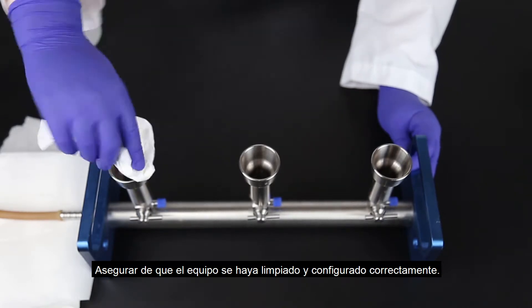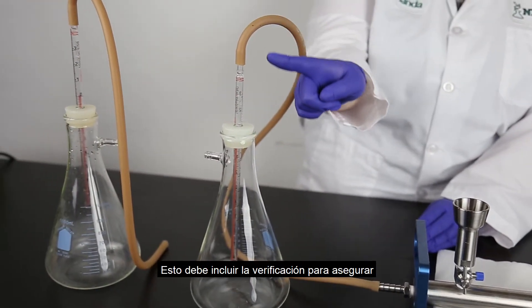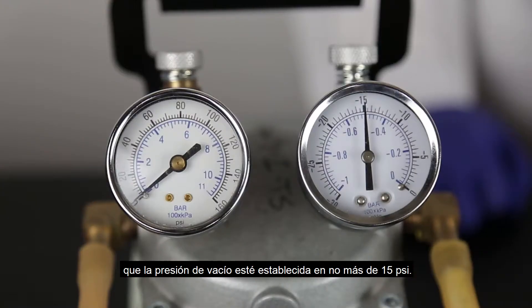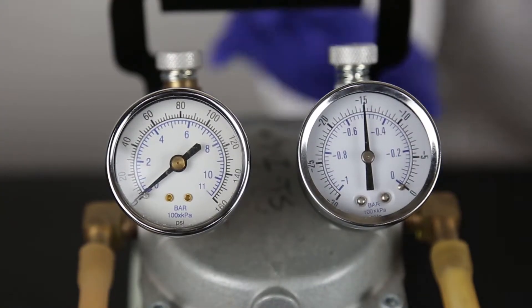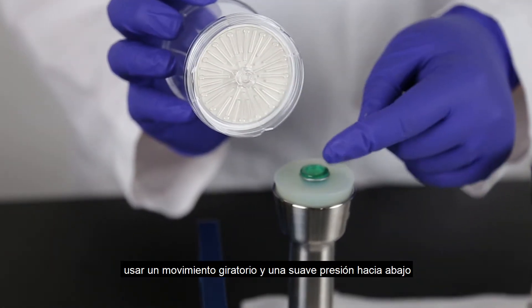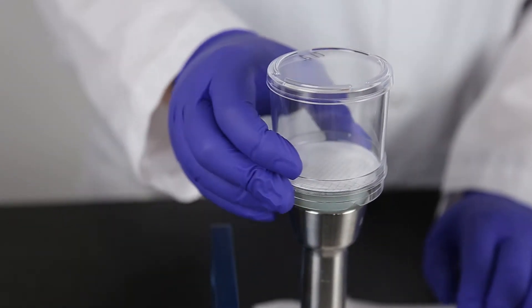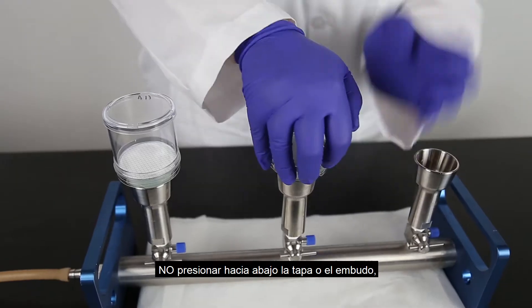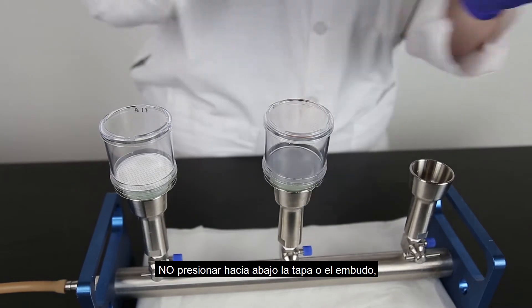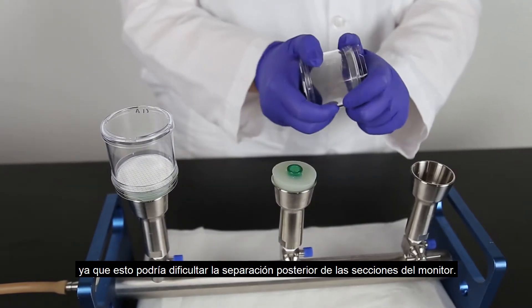Ensure the equipment has been cleaned and set up properly. This should include checking to make sure the vacuum pressure is set to no higher than 15 psi. Holding the base only, use a twisting motion and gentle downward pressure to seat the Neogen filter on the adapter. Do not press down on the lid or the funnel, as this could make it difficult to separate monitor sections later.